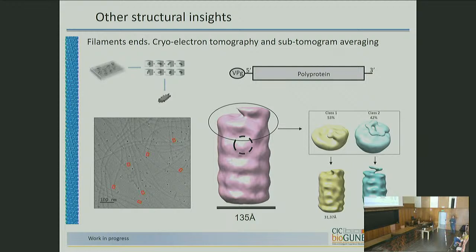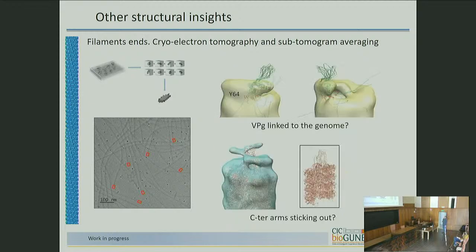And we have focused classification here at the tip with two classes, kind of a pointed end, some crazy stuff here, more thin helical something, and analyzing them later. With 30 Angstrom, so we are not sure.